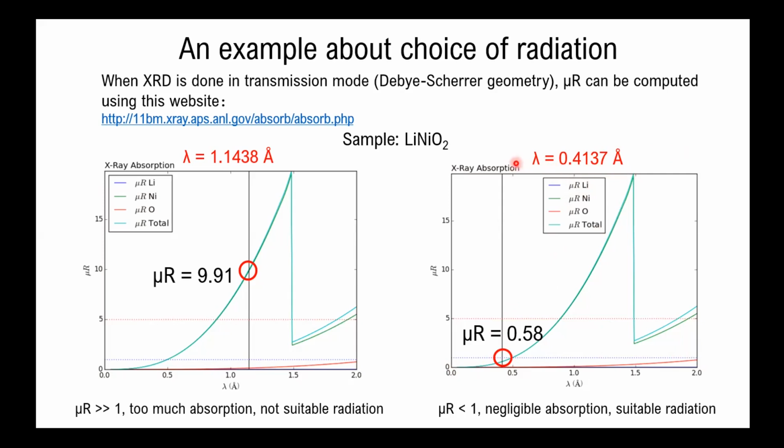You may say, okay, this is not surprising since we're using a 3D transition metal and high energy X-ray, so it should penetrate this sample. But if we measure some heavy elements, for example containing silver, molybdenum, or lead, some very heavy samples, then we need to be careful about these short wavelengths.